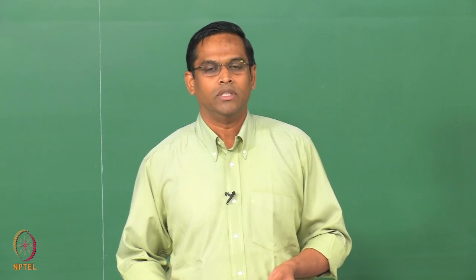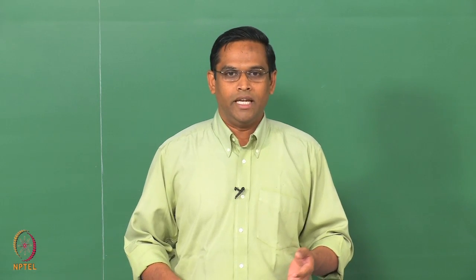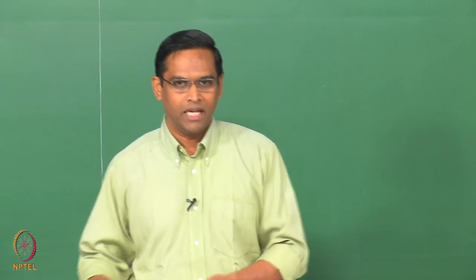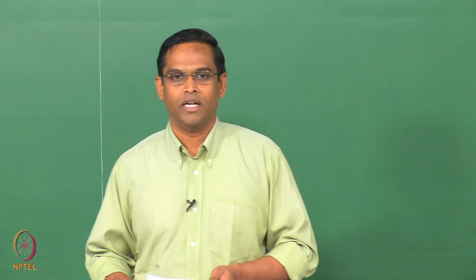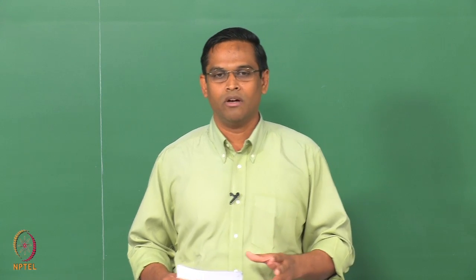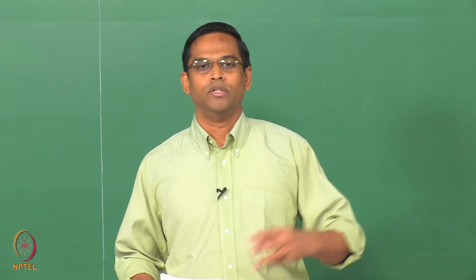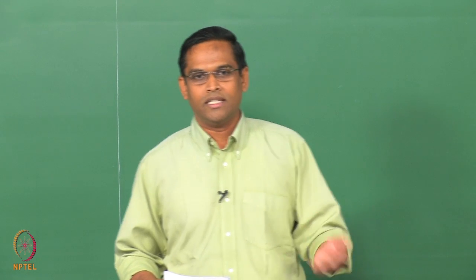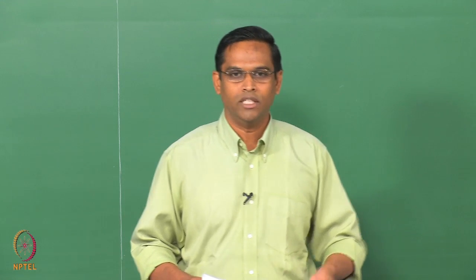I will briefly discuss the basic principles of each of these applications, and beyond that we have to look into much more detail in a specialized course, because in a general characterization course I will not get into the details of the methodology. I will discuss the basic principles of, for example, crystal structure determination, phase identification, and stress measurements. So these things we will look at in the class. Probably in later classes, I will solve some problems using these techniques in one of the tutorials if required.